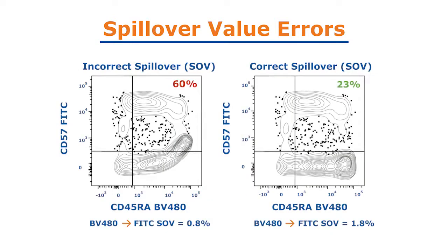In this example, the spillover values were only off by 1%, but this was enough to dramatically impact data quality and interpretation.